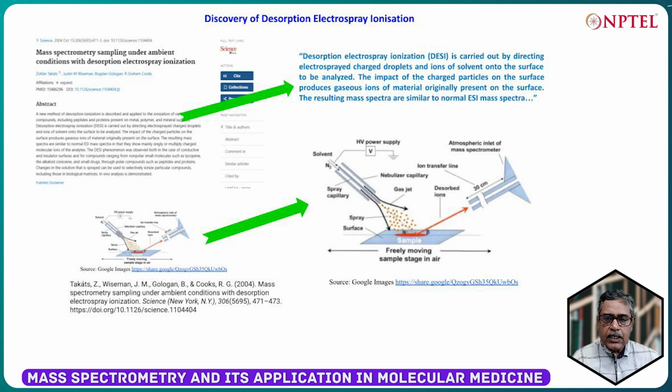So in this technological platform, it's not like the previous one, where we were going to image proteins and peptides. Here, to be honest, it's not restricted to any molecule. Mostly it is focused on small molecules, but it can go to the protein level as well.